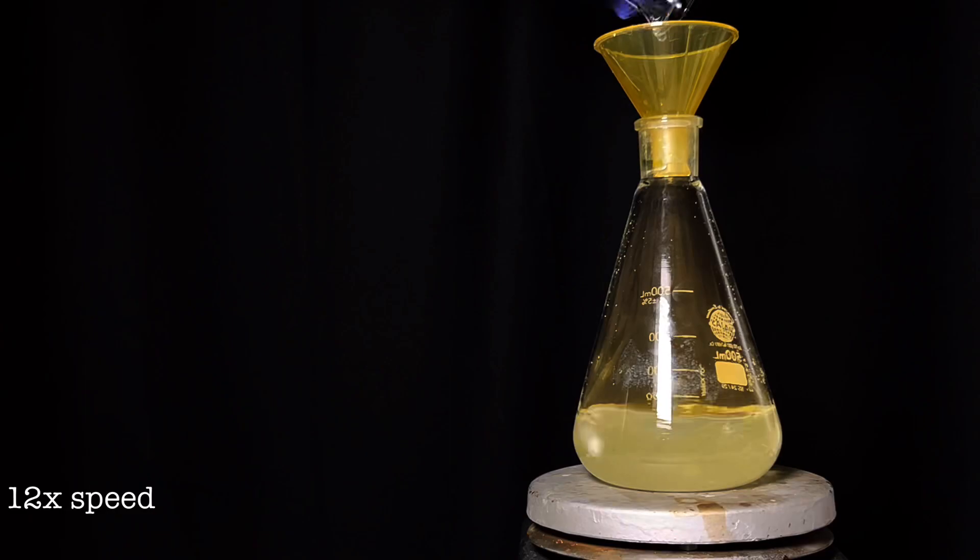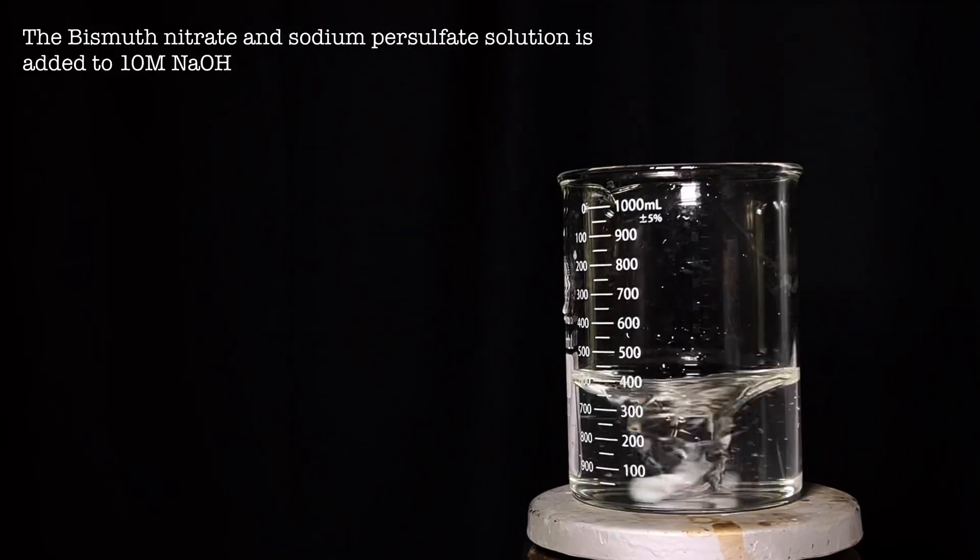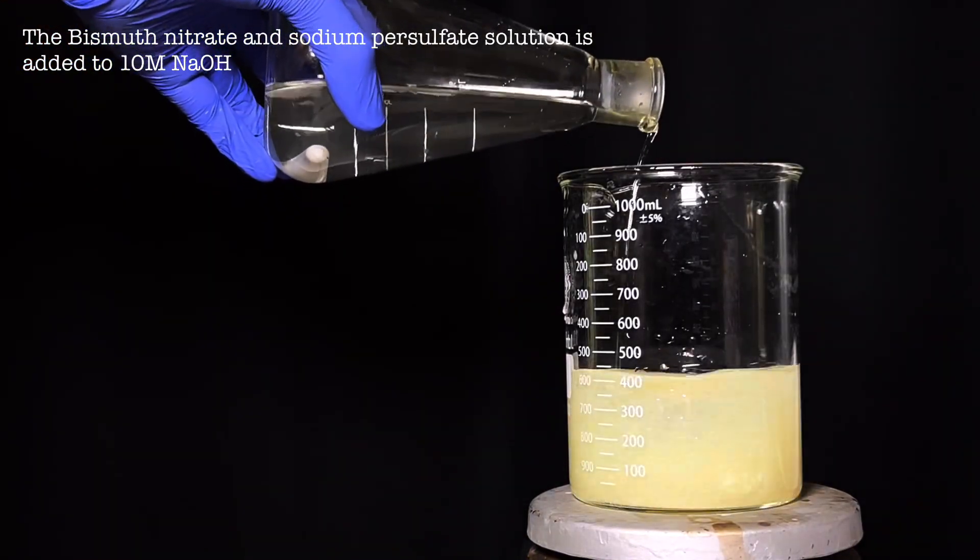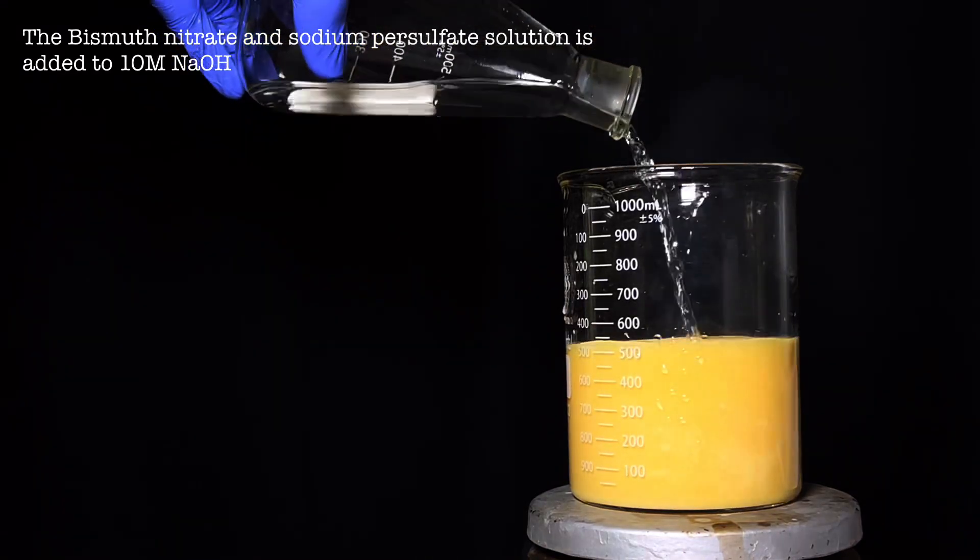Finally the bismuth nitrate and sodium per sulfate solution is added to the 10 molar sodium hydroxide. Immediately a yellow precipitate crashes out.